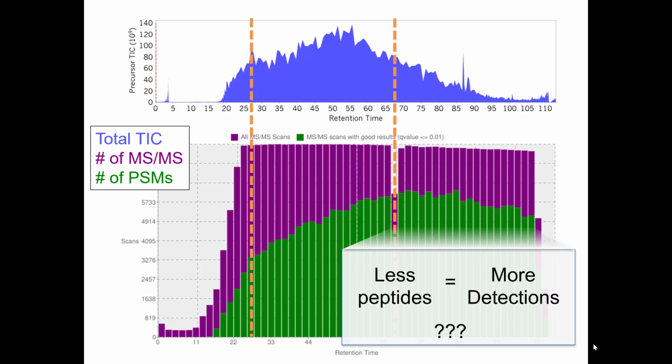Any guesses? Yeah. I would think there's probably more single peptide spectra, but there's no interference. There's definitely a lot more interference in these spectra from other peptides at the same time. So they're definitely more complex.